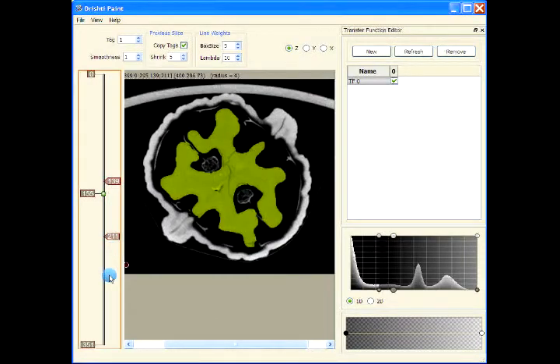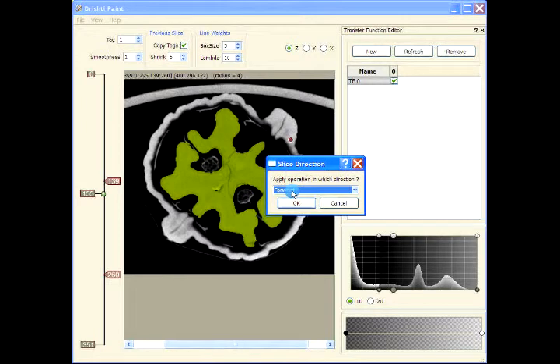So let me just increase that slice. Now I am pressing Shift T or capital T, and this operation will be repeated over multiple slices. I am going to copy these tags to the next slice, shrink it by 5, this parameter 5, and then apply the tagging operation using this box size and this lambda over multiple slices. So Shift T, and you can apply the operation in the forward direction, which is down here, or the backward direction, which is going up here. So let's apply it in the forward direction.